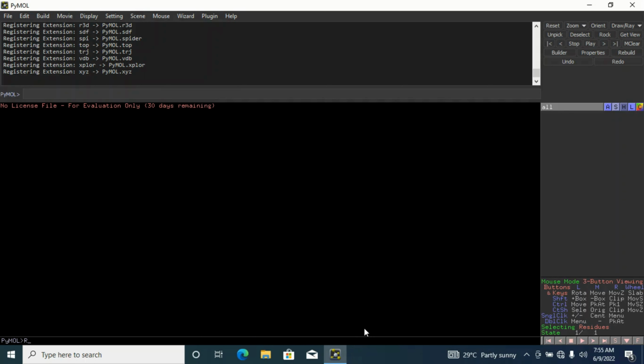Welcome to today's tutorial. In this tutorial, I'll be introducing us to one of our computational biology tools. This is Pymol. We use Pymol for several activities, especially as it has to do with visualization or alignment or some other functions you may want to perform, or even interconversion of formats of compounds or protein. So in this particular video, I'm simply going to be introducing us to the interface of the Pymol software.